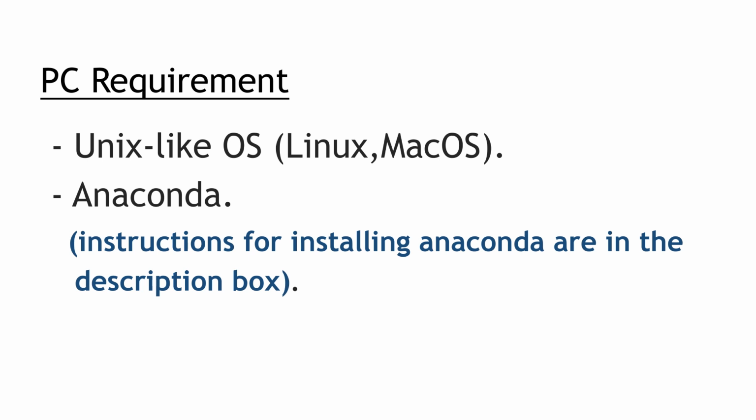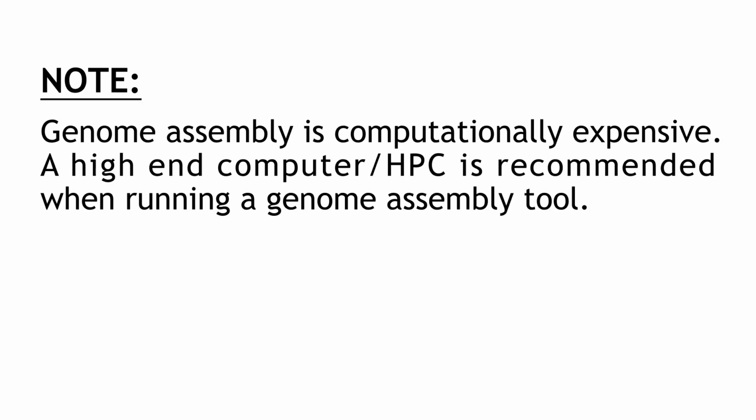Please note that genome assembly is a computationally intensive and expensive process, so you need to have a high-end PC, a PC with a good size of RAM to help do this. The advisable way is to use a Linux server that has high computational power to do some of these tasks. So just make sure you have a fairly good PC you can use for this activity. So those are the requirements.